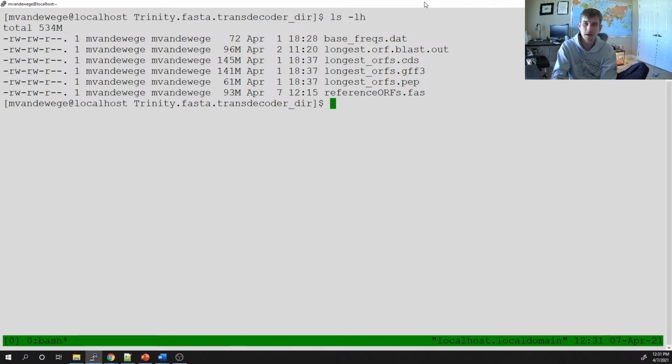So we're dealing with turtles. There is a closely related species to our turtle of interest on Ensembl that has reference CDSs. So if you have a reference, it's better to use the reference. But since I'm also just playing around in this class, doing my own little experiment, seeing what happens, we're going to use our assembled and annotated reference first, just to see what happens, and then compare that, if we have time, to mapping reads to a real reference, a much more curated and robust reference set of genes.